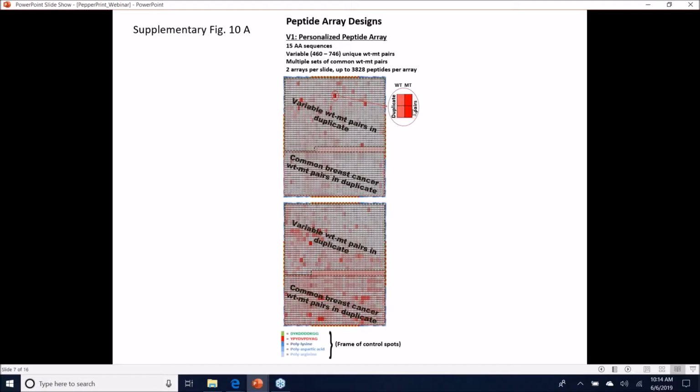Obviously, you want to try and fit as many peptides as possible per chip, because these chips can be very useful, but they are not cheap. They are very well designed, and they're somewhat expensive for us, for a small academic lab. So what we do is we've tested 2 spots versus 1 spot versus 8 spot versus 10 or higher.